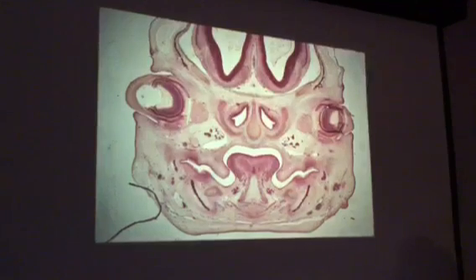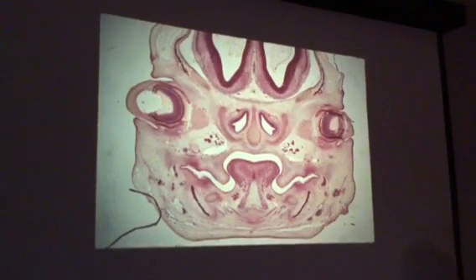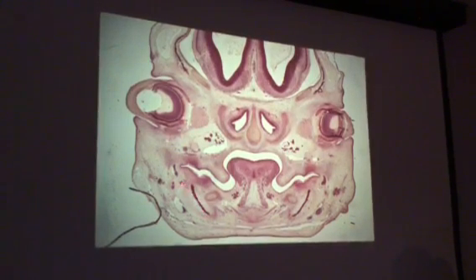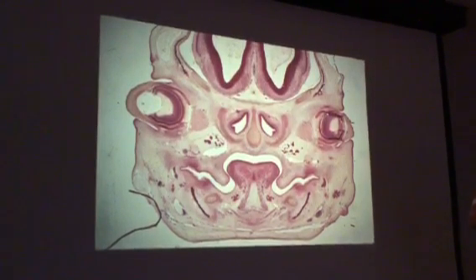Okay, and how about that right there? Palatal shelf. There's an eye right there. I'm not going to ask you the eye on the lab practical. Okay, and that right there is what? Developing mandible, and what kind of tissue is Meckel's cartilage?